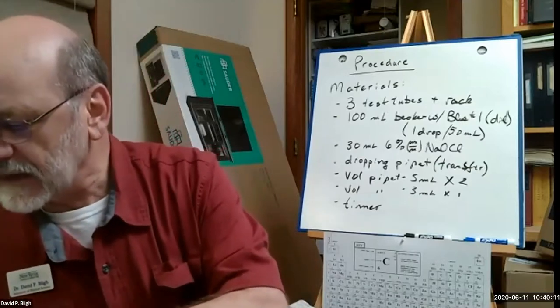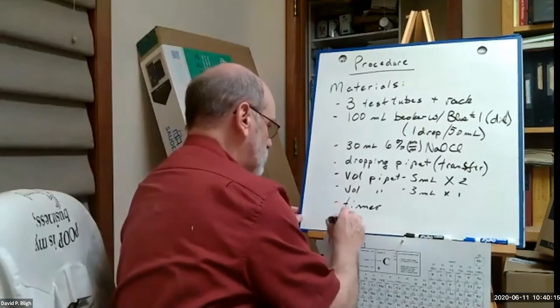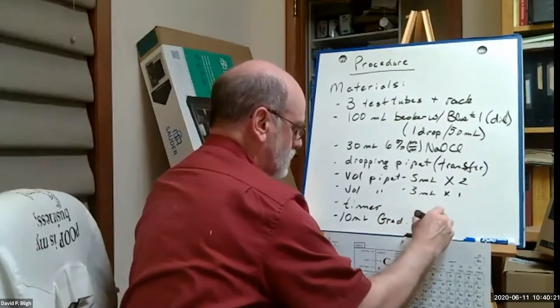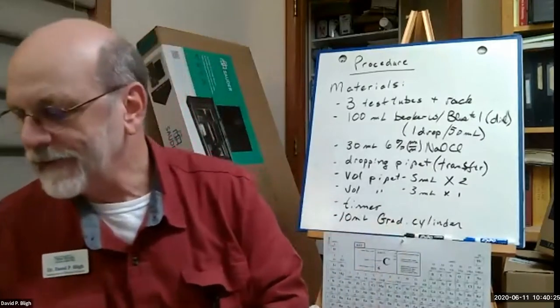What else do we need? Graduated cylinder. Okay, 10 milliliter graduated cylinder.